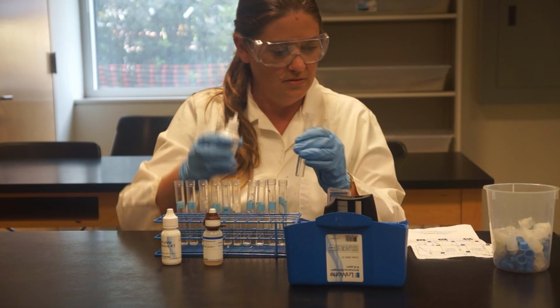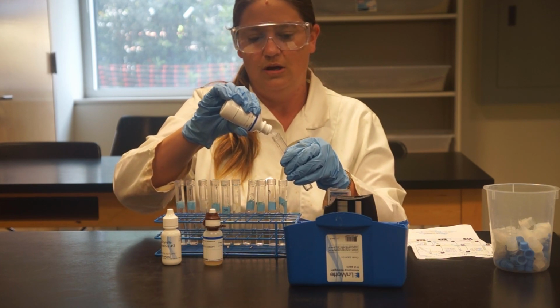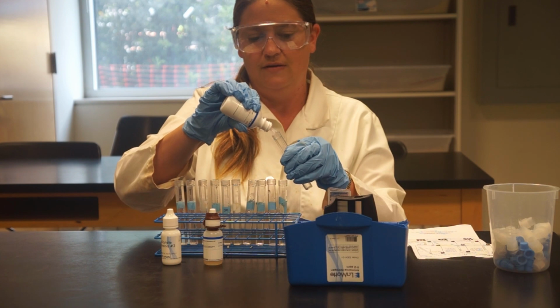Next, we will look at ammonia, another form of nitrogen. Once again, we will follow the instructions and add the chemicals to a water sample of each depth and wait a few minutes for the color to change.